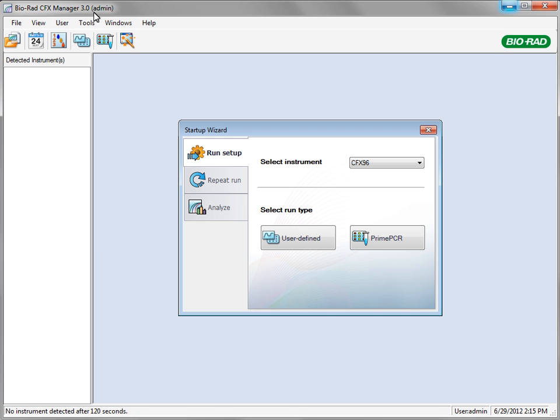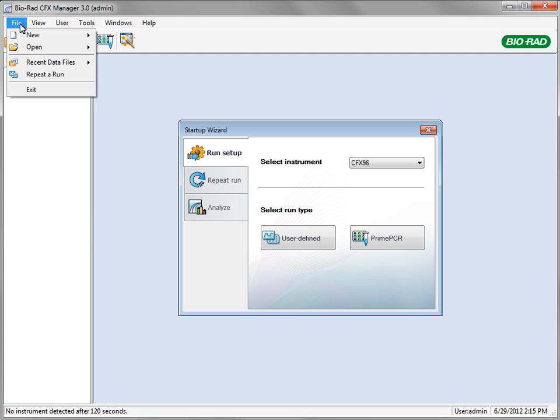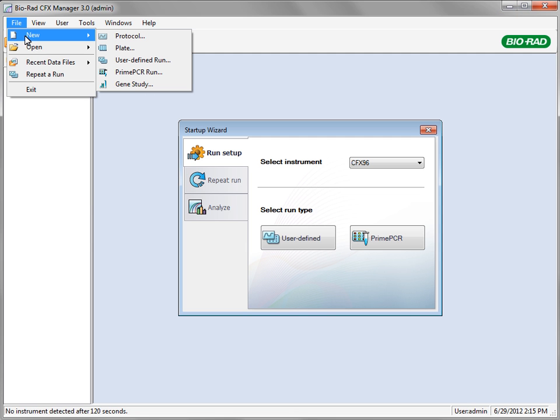Whether your experimental study is contained on one plate or across multiple plates, the data analysis tools function the same. In this example, we'll demonstrate a multi-plate analysis referred to as a gene study. To create a gene study, select New Gene Study from the File menu.